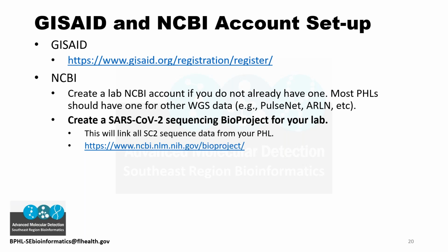But prior to doing any SARS-CoV-2 data submissions, you will need to register a BioProject for your lab, to make sure that all of your data in NCBI is linked and collected under this one BioProject. That's also linked to the CDC umbrella BioProject, and I'm about to go into that in more detail. So here's the link here.